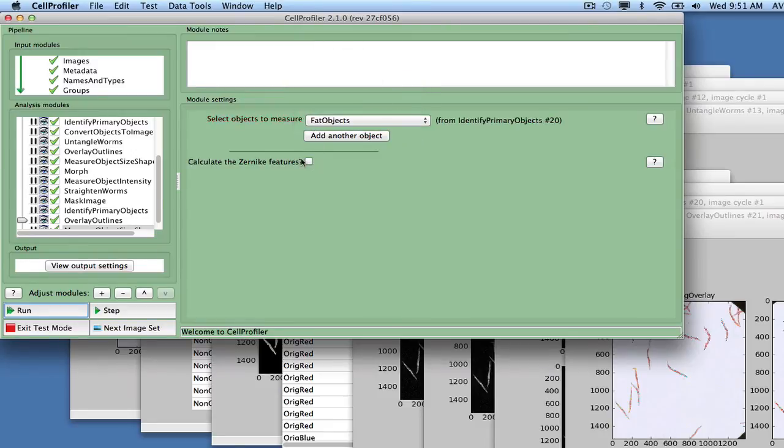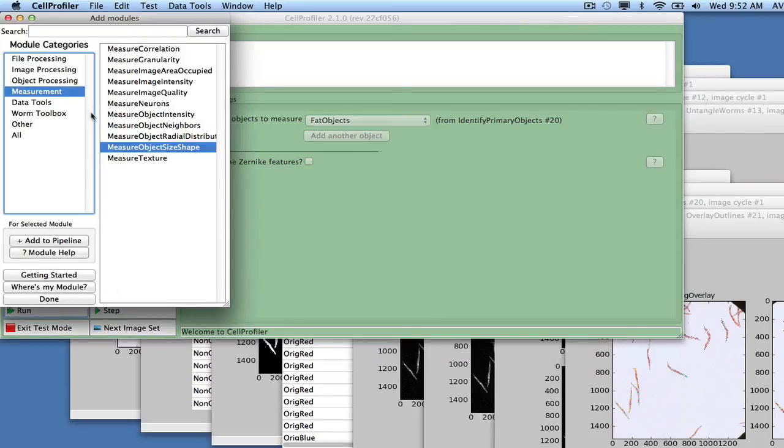We also add the module Measure Object Intensity and measure intensity features from the OrigBlue and OrigRed images, with fat objects as the selected objects.